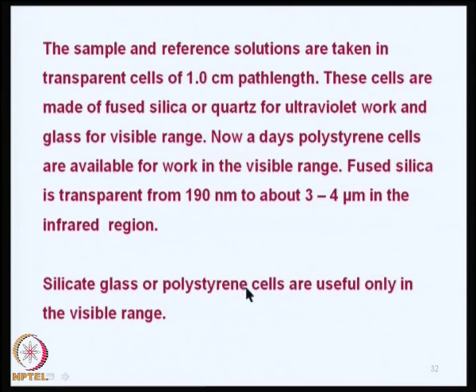Silicate glass or polystyrene cells are available in the market, which are much cheaper. They cost you hardly 50 paise or 1 rupee each.